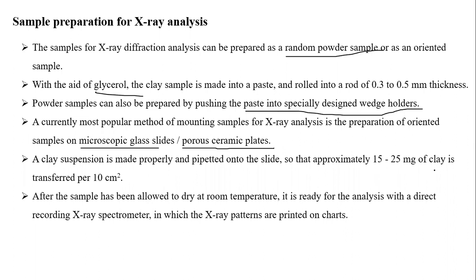Approximately 15 to 25 milligrams of clay should be spread over 10 square centimeters. When we use these glass slides, we should have at least 15 to 25 milligrams of sample. The sample should be present within that 10 square centimeter area. After treating the sample, we should allow it to dry at room temperature.